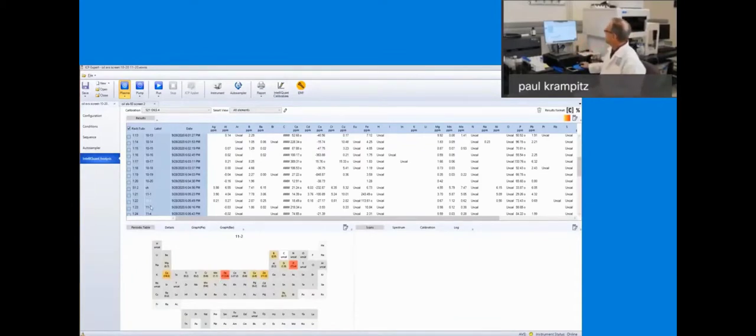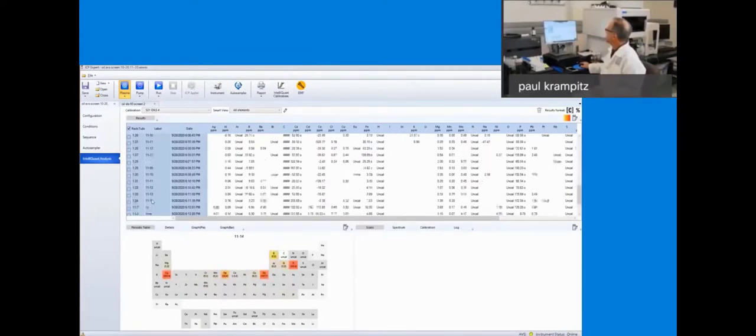And I'll just click through a couple more here, see if there's any big surprises. I haven't looked at this data yet, so you and I are looking at this thing at the same time. Now, this oil is a little bit different than the other ones. I'm not sure which one that is. That's 1118. This one just looks a little bit different to me.